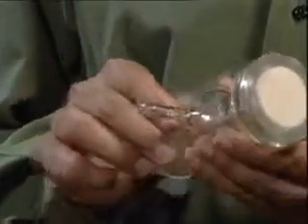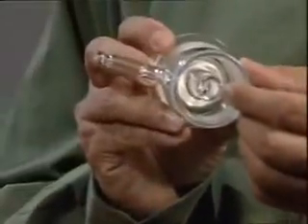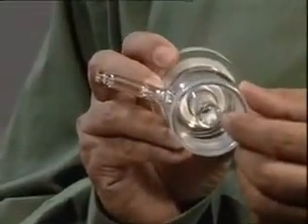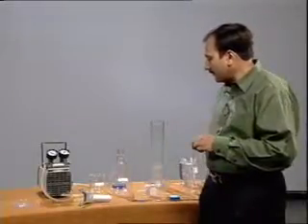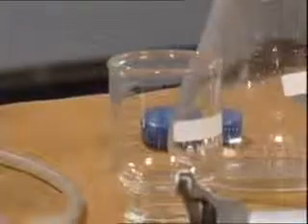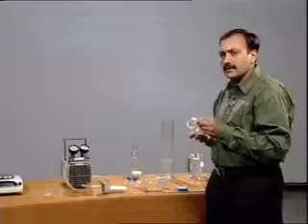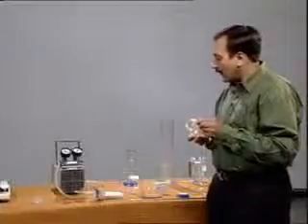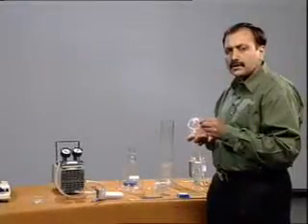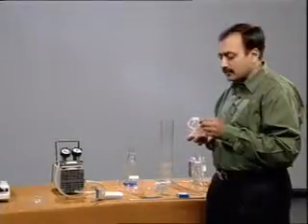There are two tubes, one for connecting it to the suction pump and the second to draw water after filtration. A funnel with a ground glass seal of 300 ml capacity. Now, all these items have ground glass so that they fit in properly and make air sealed joints.